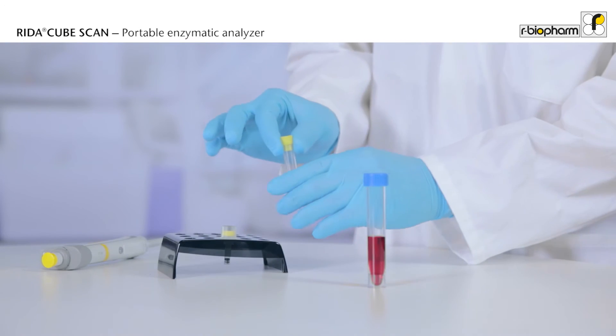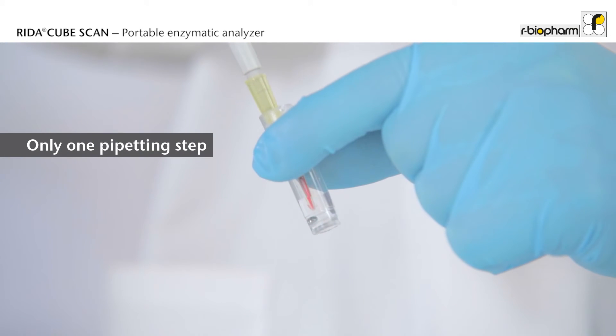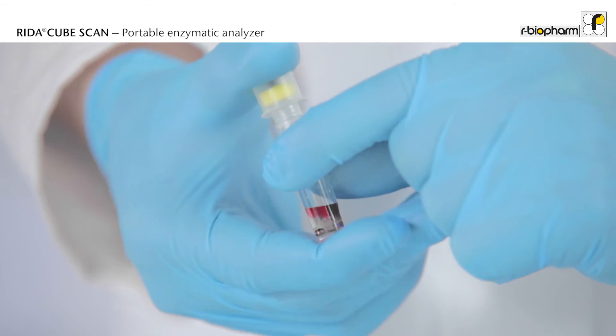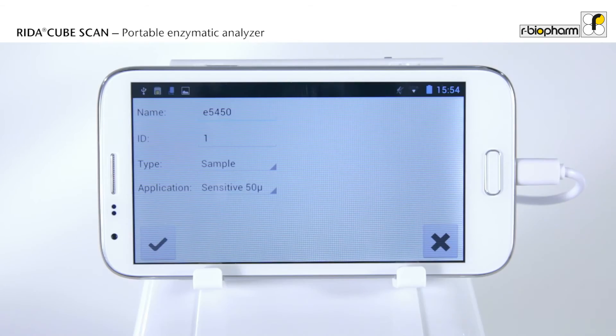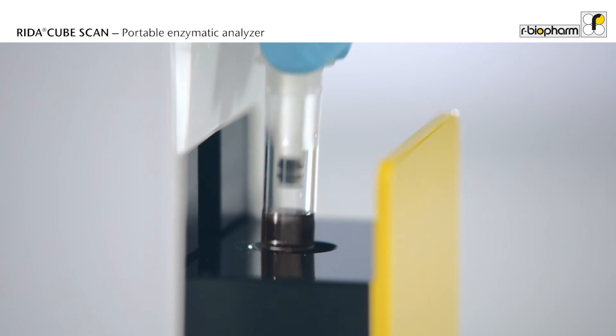Open the test tube and discard the cap. Pipet the sample into the tube and close the tube with a specific reagent cap. Now the tube is ready. Press on start.